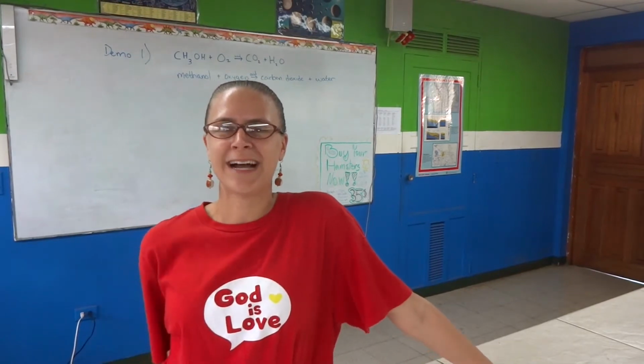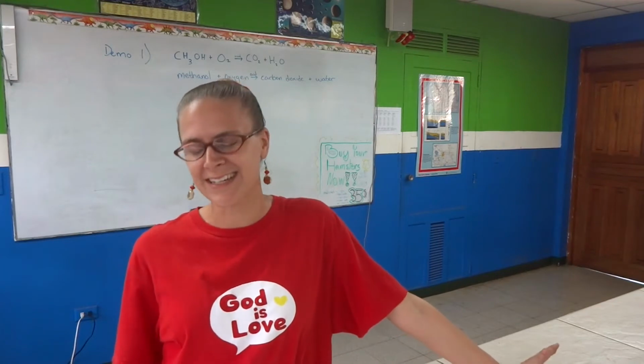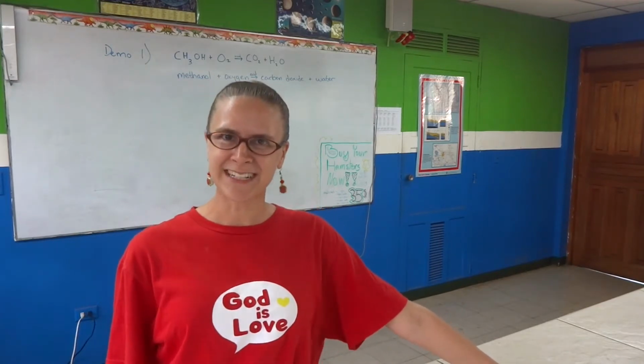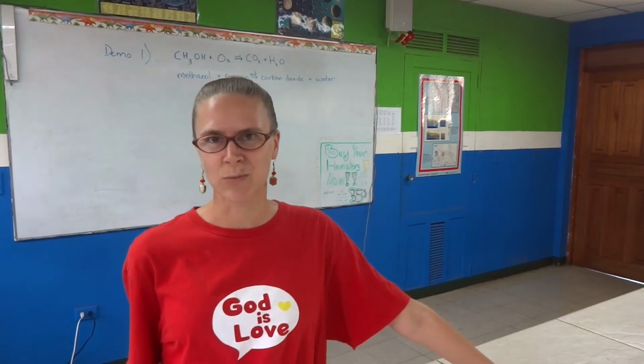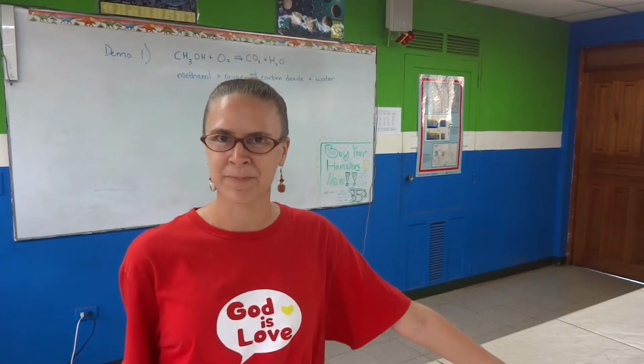Everybody. So I had wanted to do a lab with you guys this week, but we are not in school, so I'm going to try something different. I'm going to do a lab on a video. I'm going to do 5 different demonstrations of chemical reactions. There's one for each of the 5 types of reactions that you have learned about recently.